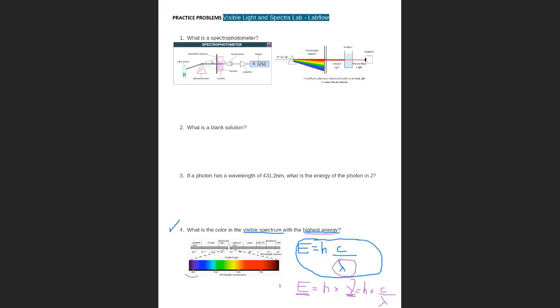If we have a light of high energy, it will have high frequency. But the opposite is true with the wavelength. And now we are going to share the page of the report, which is pretty simple after you have listened to all my introduction. And I hope it will be clear and easy to solve.